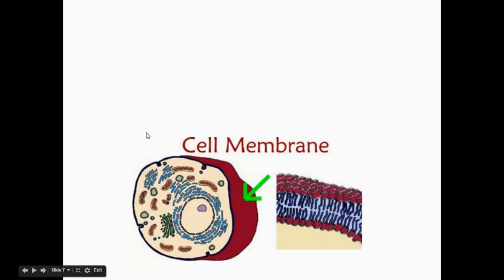All right. Now you're back. Okay, I'm going to lead you through the first part of the Potato Diffusion Lab. It's a blue packet, so find that blue packet that I gave you, okay? Now what I'd like you to do first is take a few moments and read the top half of the front page, the very top half, where it says Introduction, okay? And hit pause.